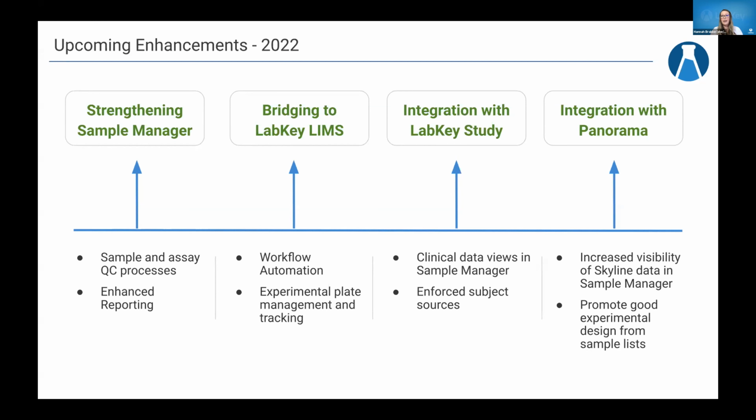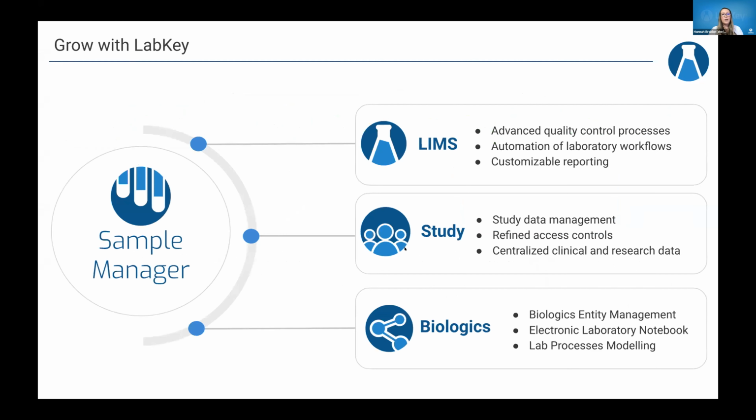And then lastly, wanting to integrate with Panorama, wanting to provide groups using Panorama with a way to continually centralize their data, having more visibility of Skyline data within the Sample Manager application, and promoting really good experimental design by being able to do blocking and other things from sample lists.